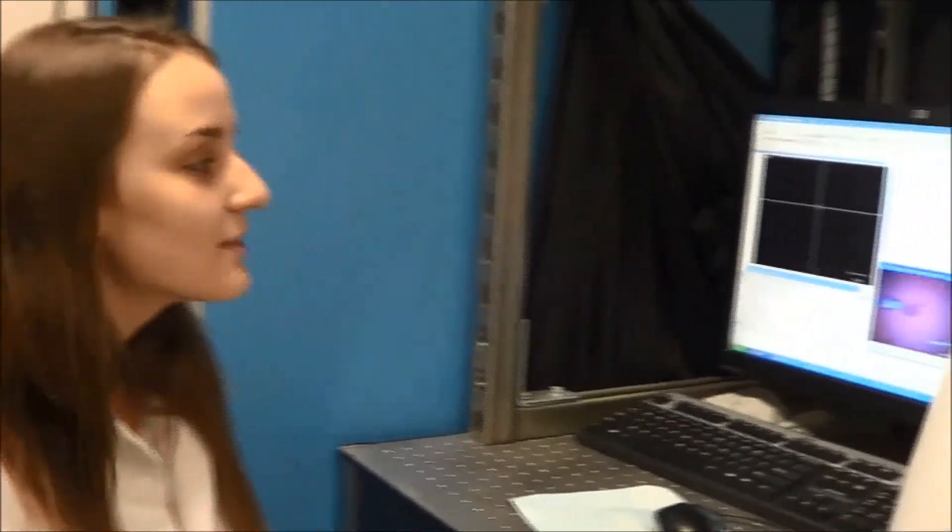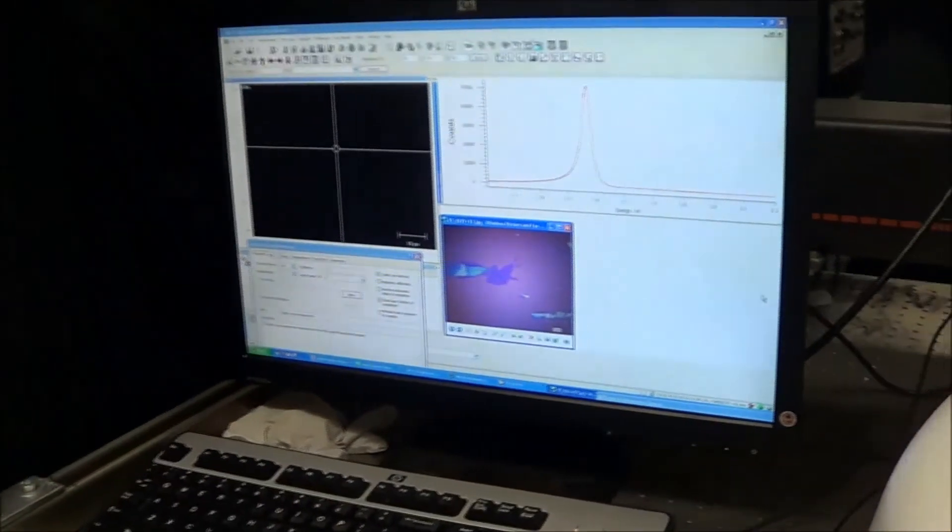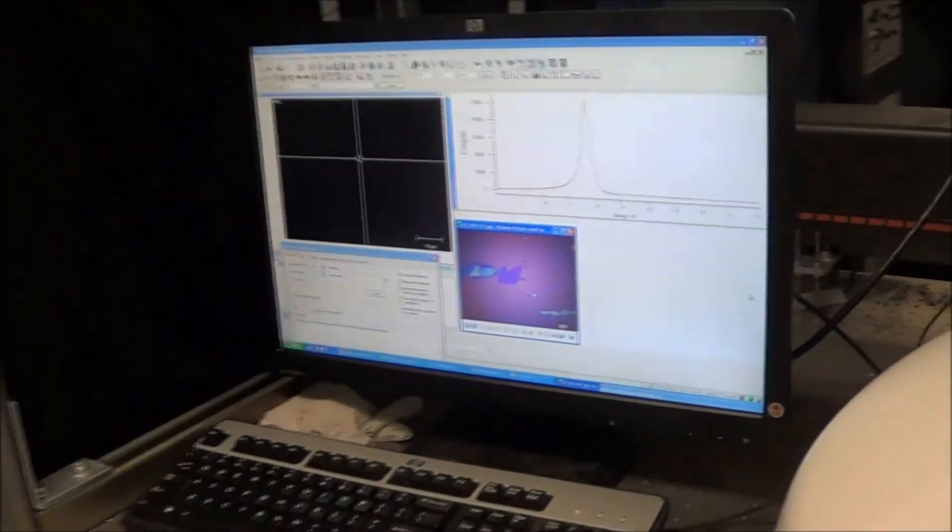The next step in characterizing our flake is by using the same machine but changing our settings to photoluminescence. The photoluminescence test will give us information about the band gap, which in turn will allow us to understand whether or not we've exfoliated to monolayer.